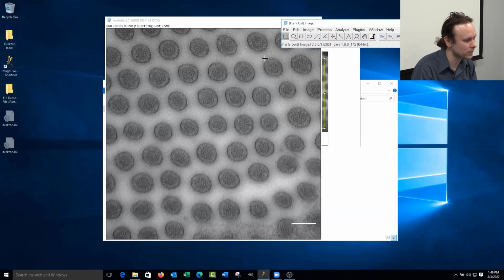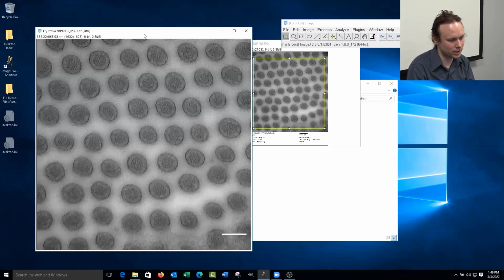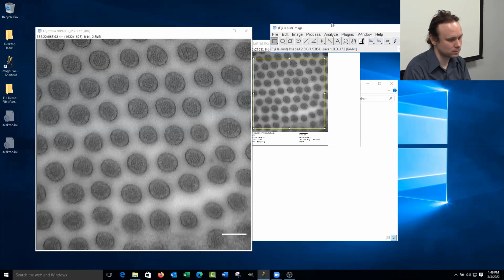Something like that. All right. Once we have these things, we haven't actually gone over saving yet. So let's do that. We have a scale question real quick. Okay. From Ella, how do we know that FIJI has not read the pixel information in the image?